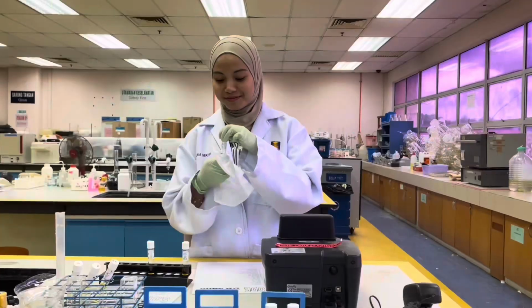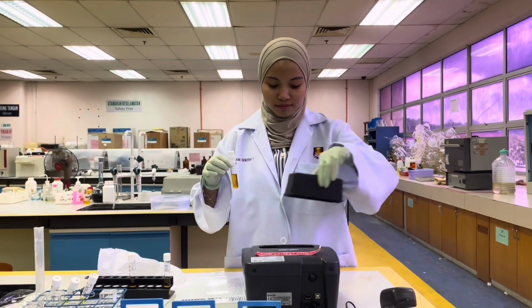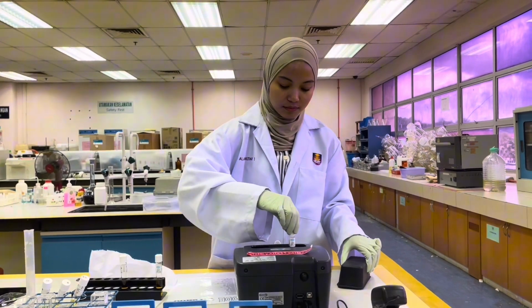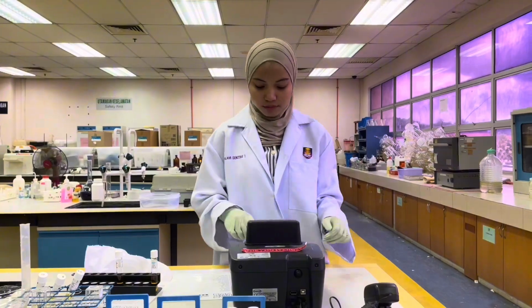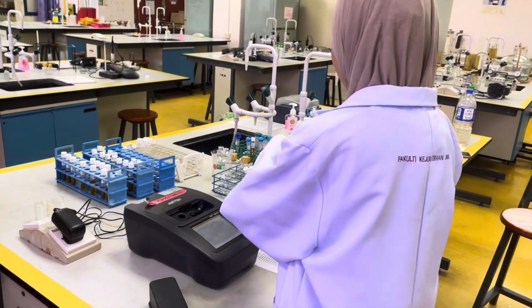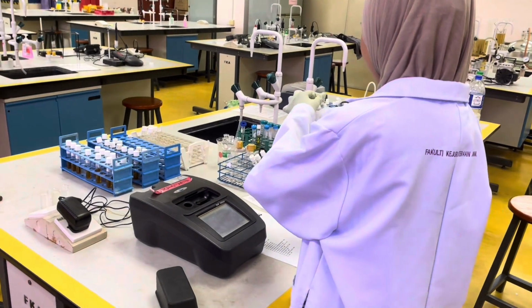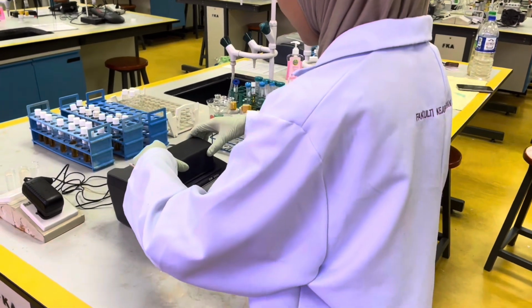Wipe off the vial containing blank solution and place it into the holder and close the sample compartment. And then press the 0 button. The display will show 0. After that, remove the blank. Wipe off the vial containing sample and then insert it into the sample holder and close the compartment. Press the read button, and when the data is displayed on screen, record the data.